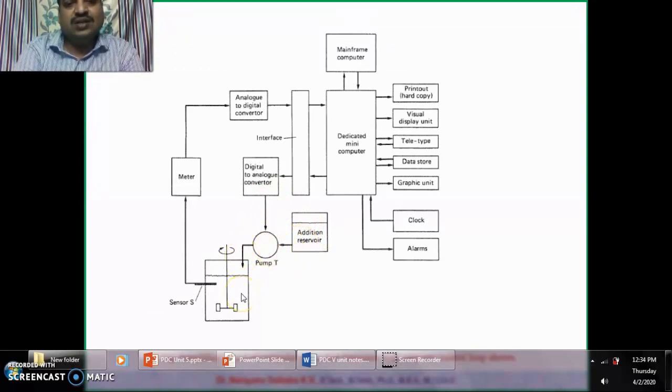Okay, so addition, as we already discussed, we will have two types of things for pH control. Acid cycle will be there, then followed by mixing cycle. So acid control cycle will last for 0 to 60 seconds. Okay, so after addition we'll go for mixing cycle. Sorry, 0 to 5 seconds is addition cycle, and 0 to 60 seconds for mixing cycle.